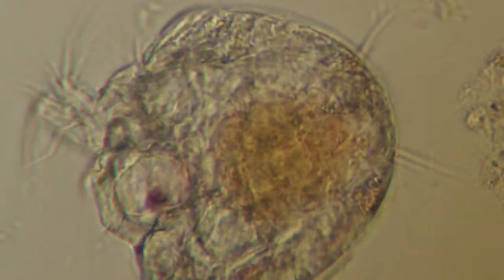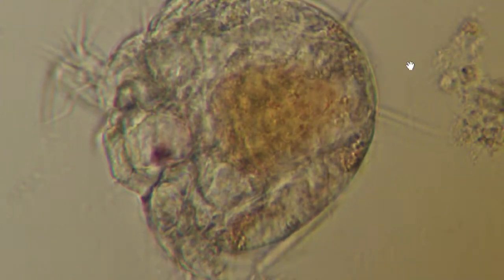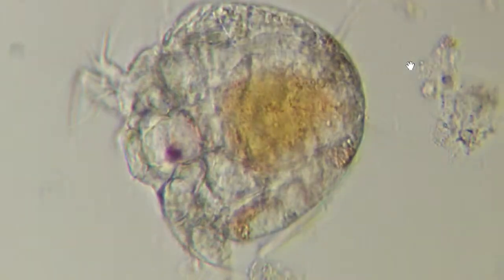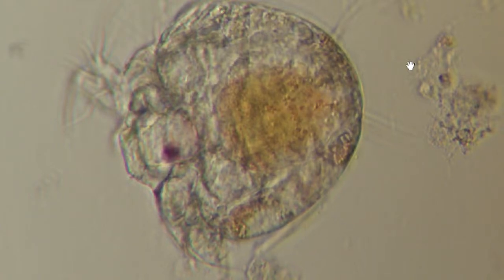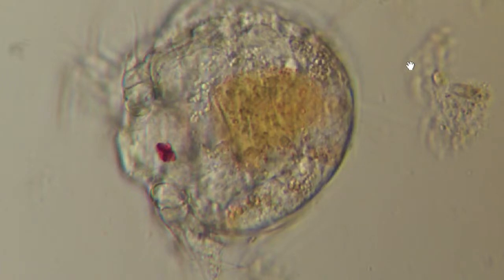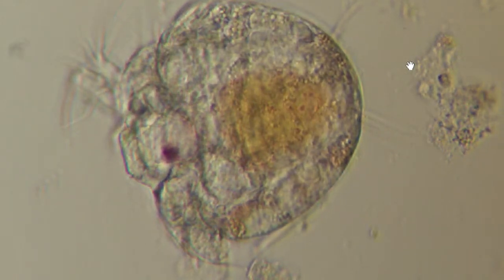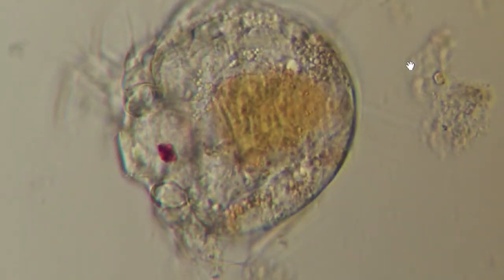Yeah, there's another little larva, a copepod larva. So it has the, it's more of the natural color there. So you can see the guts are moving around in there. It's got the red eye spot, which is really nice. And the limbs there with little bristles on them, which will eventually grow quite long. But you see all the guts pulsating in there.